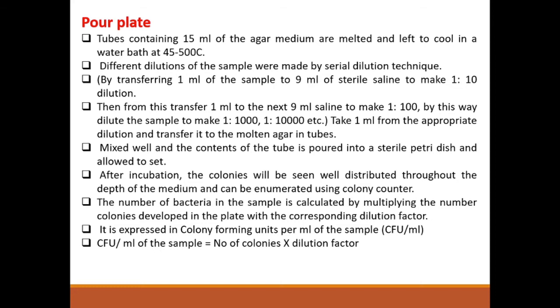Now we have different agar plates with different dilutions of the organism. After the agar has completely set, keep the plates in the incubator for 24 to 48 hours. Normally 24 hours, but if it is a soil sample, we have to wait for 48 hours, that is 1 to 2 days.